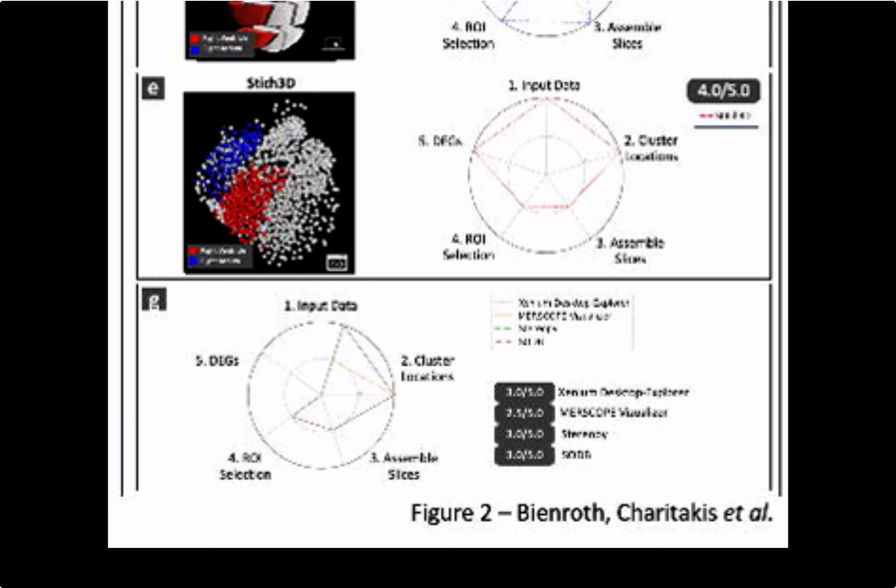Understanding molecular signatures of pediatric cardiac rhabdomyomas using VR-Omics. To further illustrate VR-Omics' unique end-to-end capabilities in the analysis of multi-slice datasets, we tested it on an original coplanar dataset to interrogate a disease mechanism that has not previously been transcriptomically investigated.